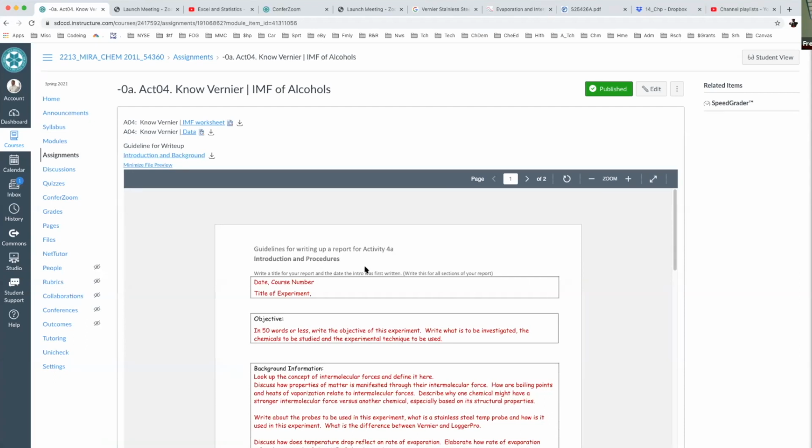You're going to enter your data and observations in Canvas, and you're going to enter your post-lab write-up in Canvas. But based on the grading criteria that I use for this class, I want to guide you as to what you should include in this particular activity, which we are treating as an experiment. This is not a lot of points, but I want to make sure that you guys understand what should be included in a regular experiment.